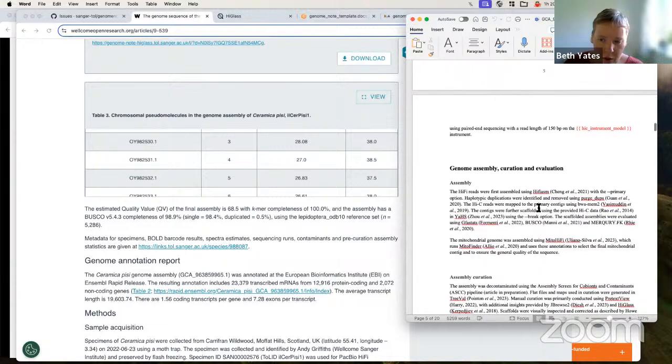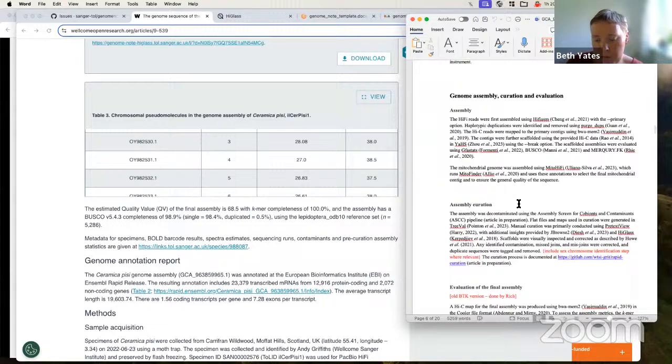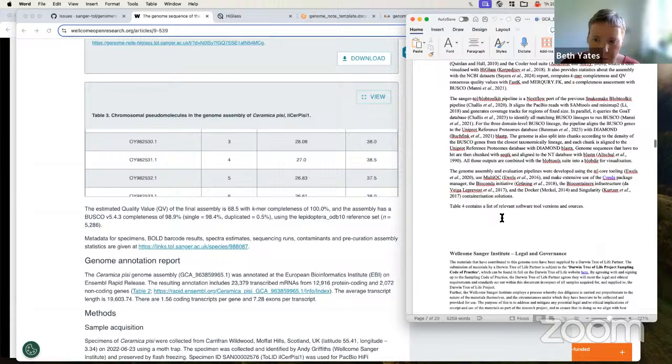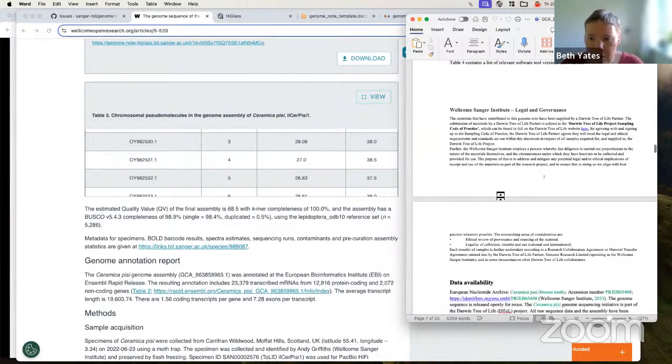You can make changes to the content of the Genome-Note if you want to. For example, one of the groups we're working with wants to include a discussion section, so they can add that within their template. That's much harder to automate though, because that's going to be very dependent on the assembly, but there are perhaps things that can be done. They can include different assembly metrics.